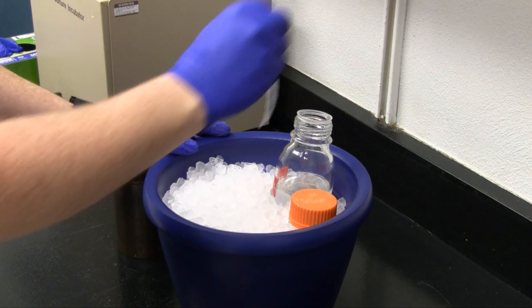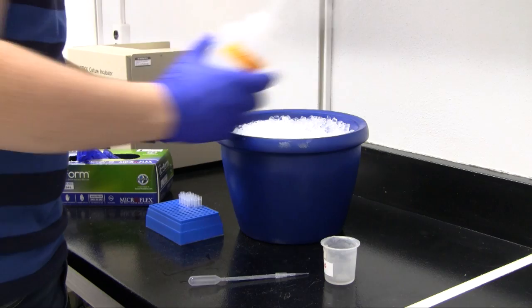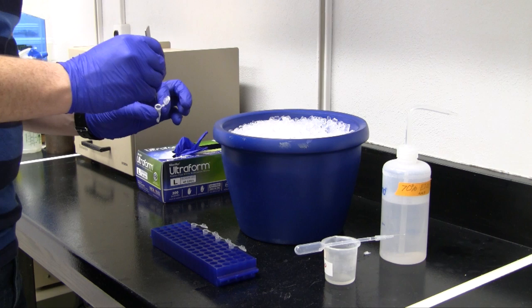After fixation, the acetic acid is removed with a pipette and replaced with 70% ethanol. Finally, roots are moved to a fresh tube containing 70% ethanol and can be stored for months at negative 20 degrees Celsius.